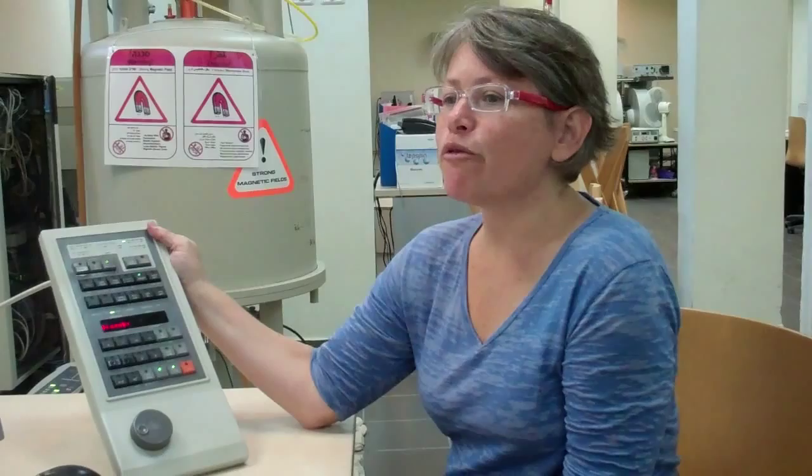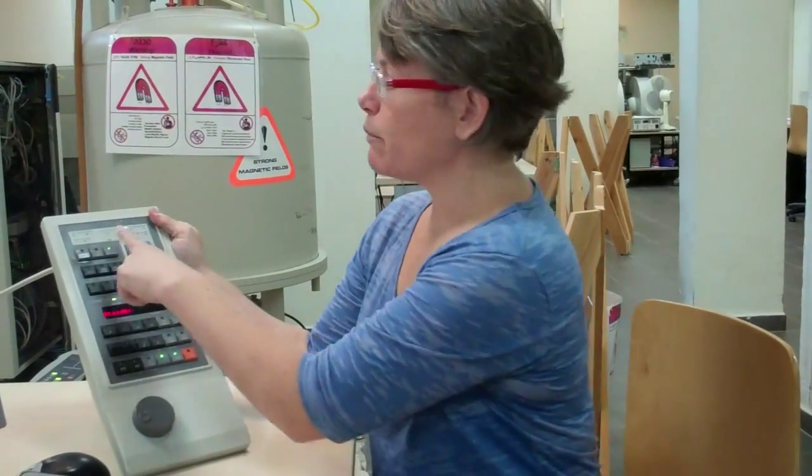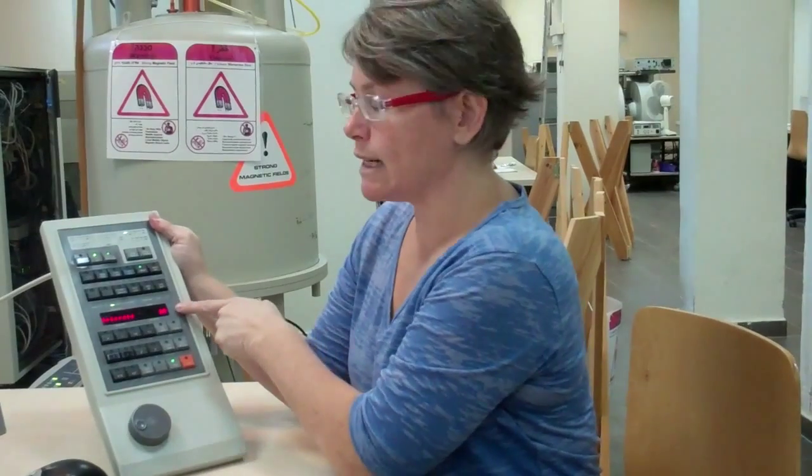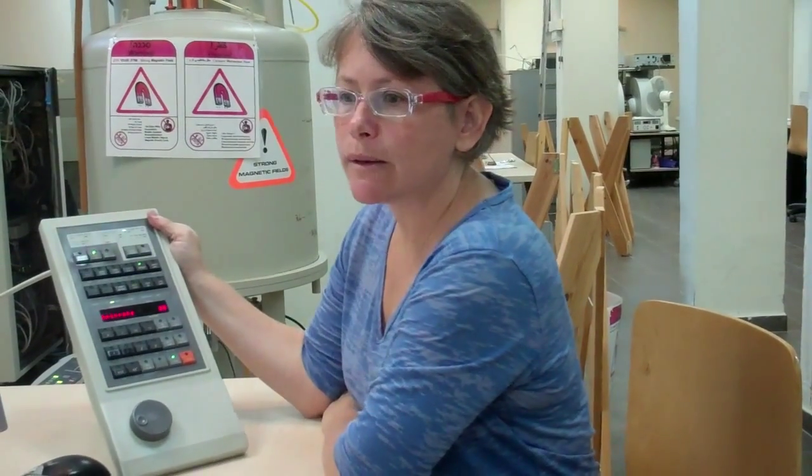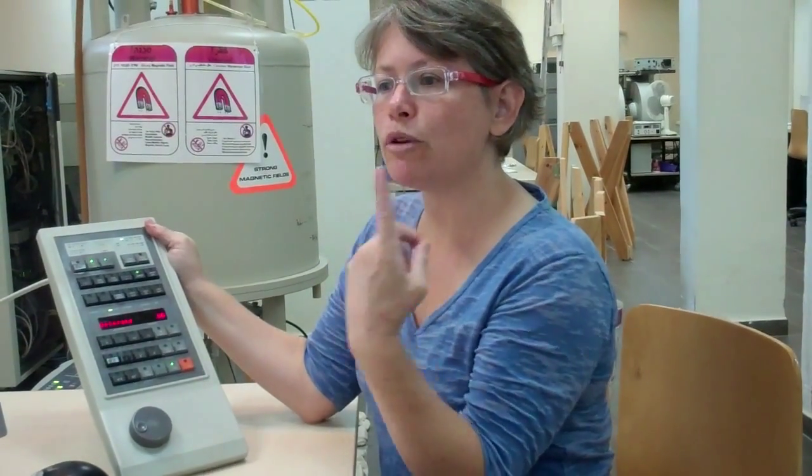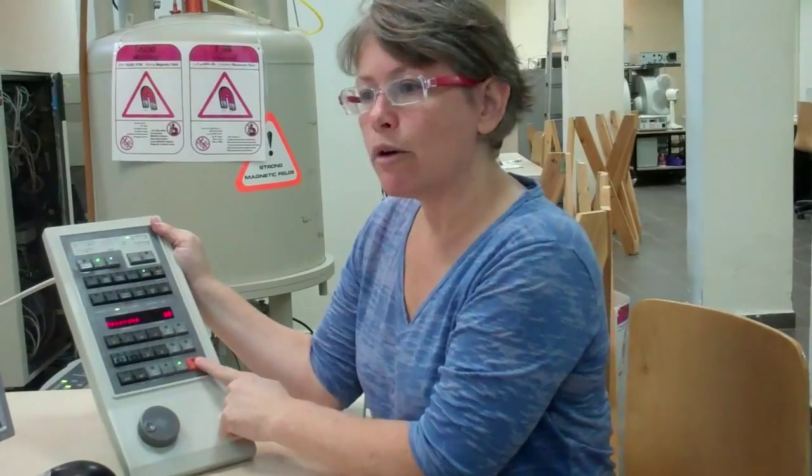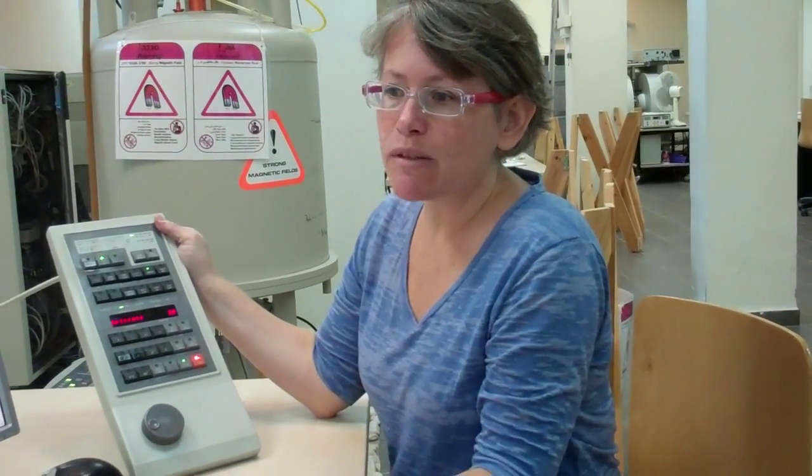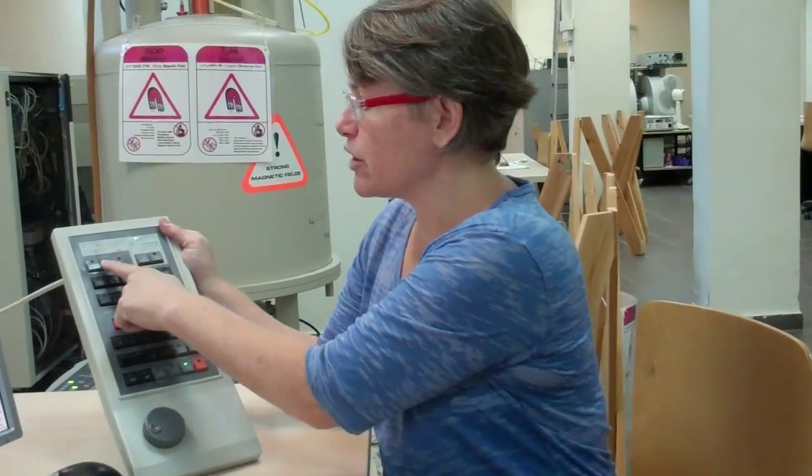To see what spinning frequency we requested, we can push this middle button labeled spin rate. It says 20 and the units are in hertz, meaning that we requested 20 rotations per second. In order to see the actual spinning rate, we'll use this orange button which is labeled second. In order to activate the second function of the spin rate button, the function written below the button, which is spin measure.